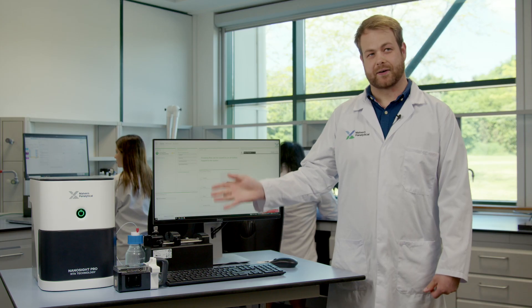Welcome to the lab. Today I'm going to be giving you a short demo of the new Nanosight Pro. I'm Jake Austin and I work here on the product development team and I'm really excited to show you what it can do.